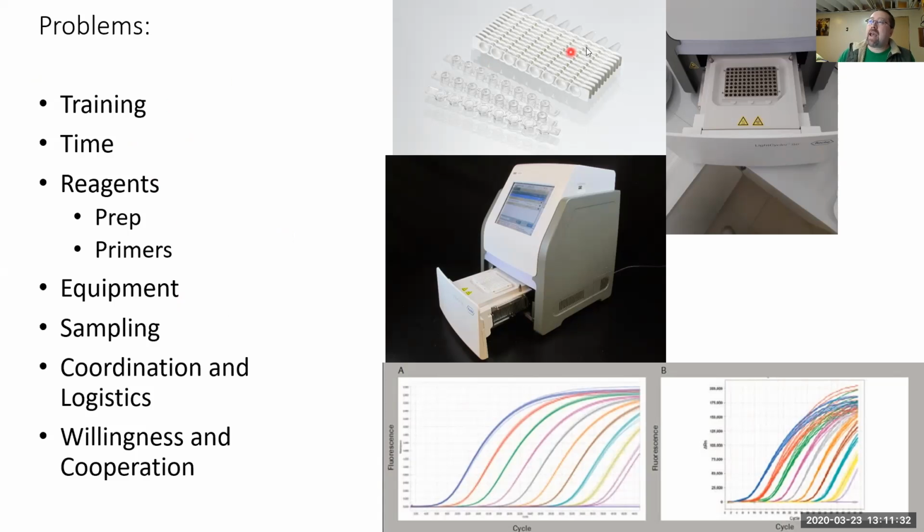Basically, you can have the temperature change in these tubes very rapidly. So rapidly that you can denature in 5 seconds versus something longer. So you can put them into these trays on the light cycler, and it all slides in. This is beautiful compared to what I had. And then you can see the results in real time on this readout, which you can see here.